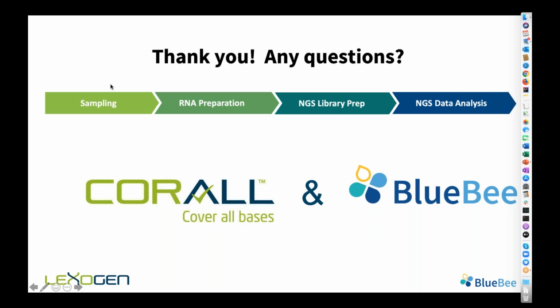And can you upload custom genomes for alignment? That's not possible at the moment. What we can do is to make it available to you. If you have a custom genome sequence, it's not as straightforward, not as easy as just making it available for everyone, if you want to have access just for you, but it's possible, we can do it.